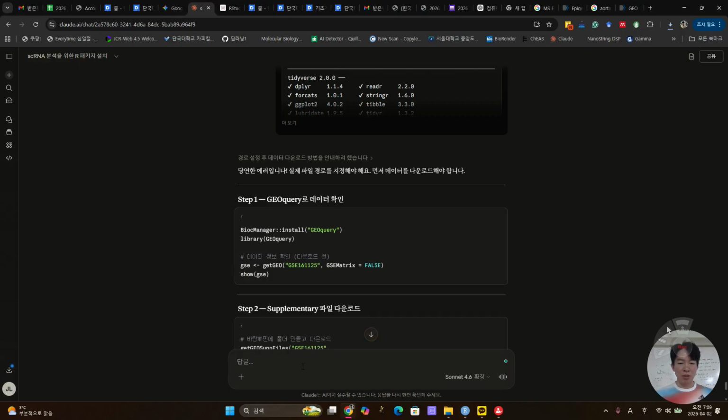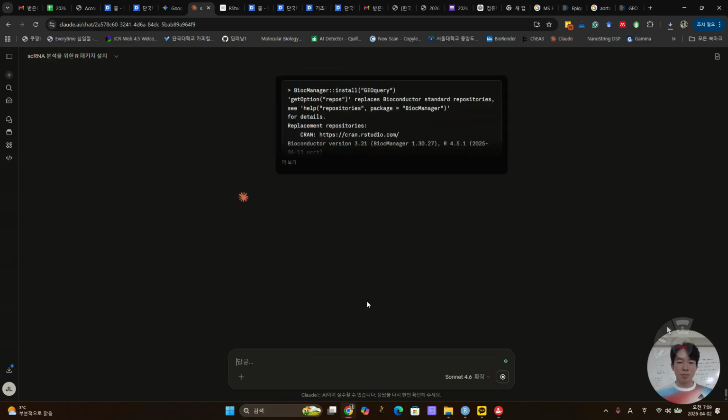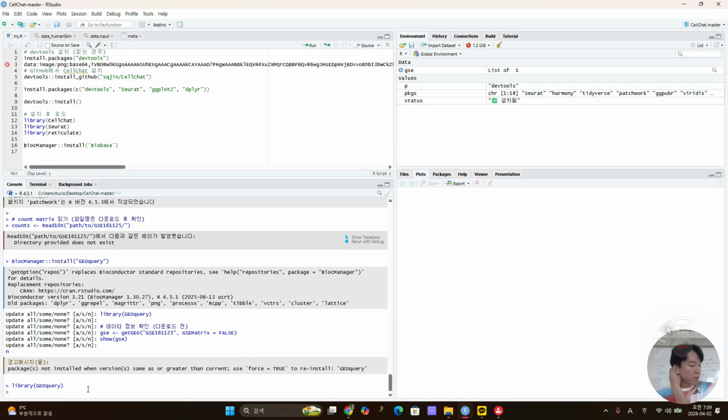So I copy and paste here. Library, copy, set.